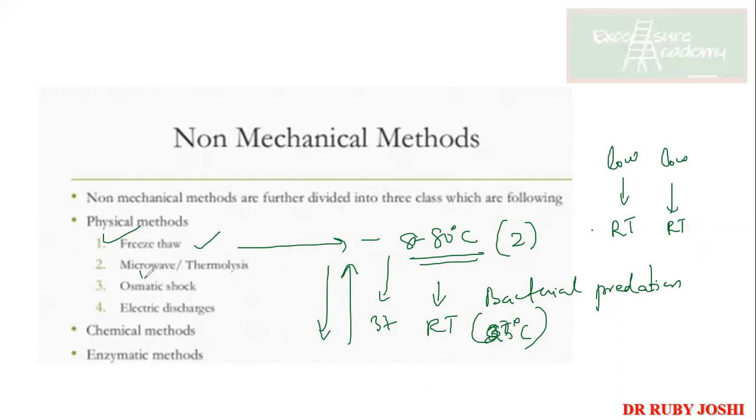I haven't used microwave or thermolysis, because most of the research is based on protein and DNA. If I use thermolysis, it is going to denature my product, right? So I haven't used it, and I never saw anyone using thermolysis.